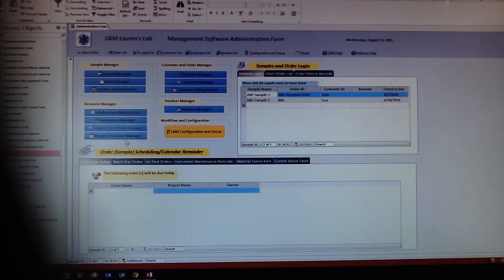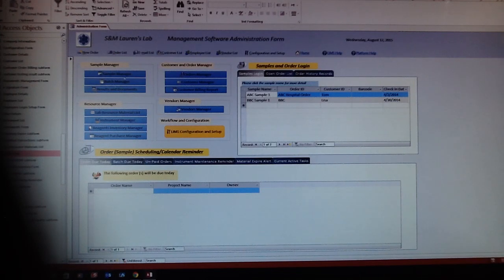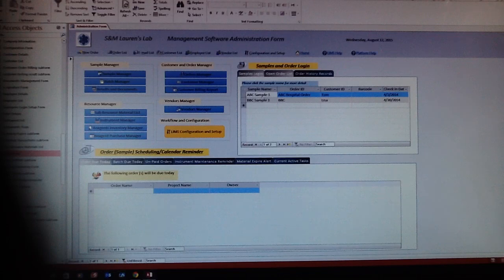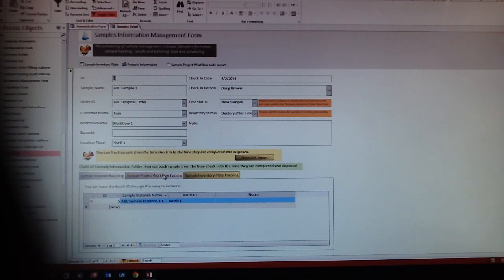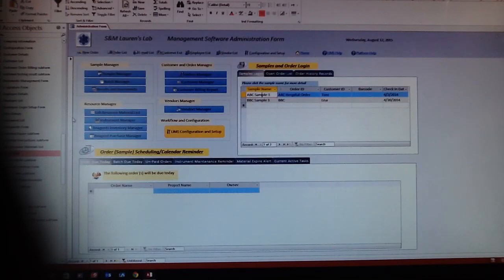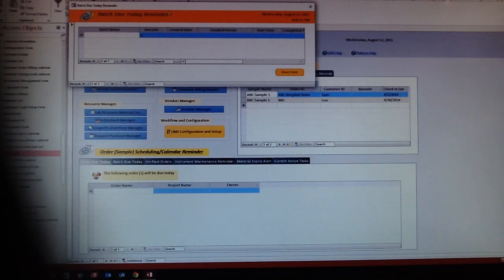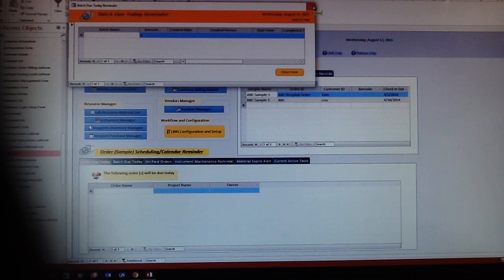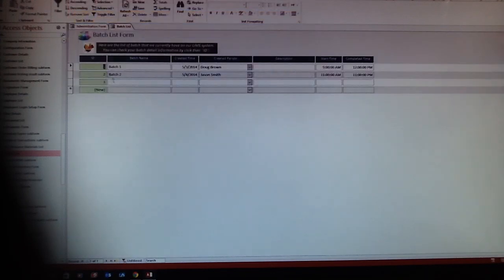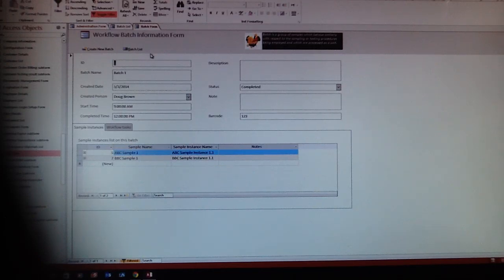After that, when the sample comes in, you can log in the sample. Click the sample name and you can get all the sample information here. That's batch. You can always define the batch to do the test. Here's the warning for today's due batch. We don't have any batch due today, so the form is empty. We'll close that and double click to get the batch information.